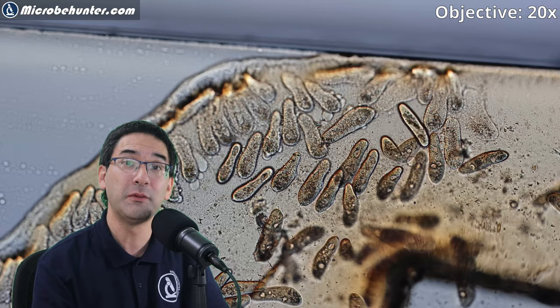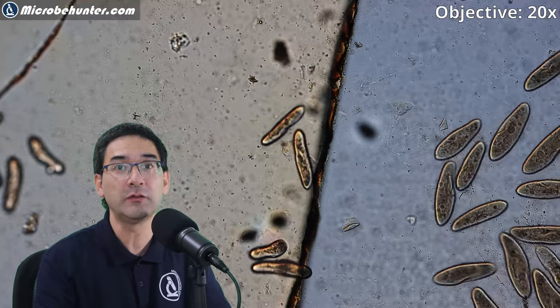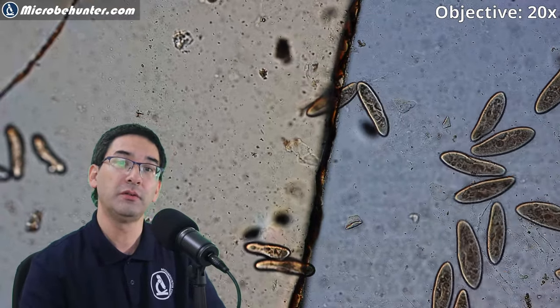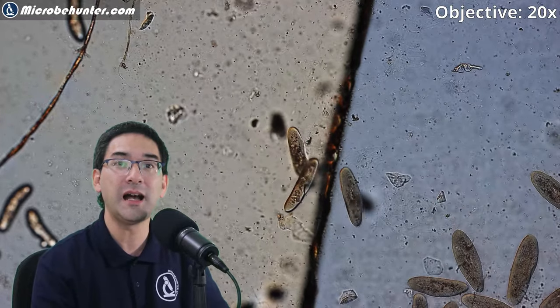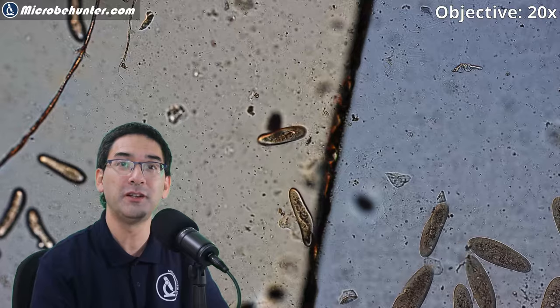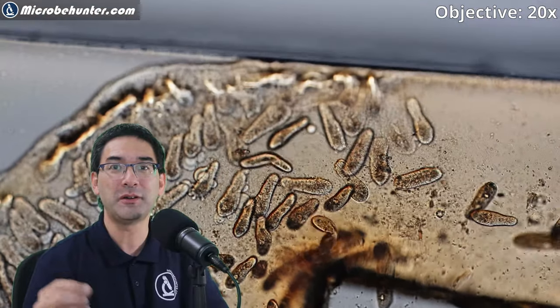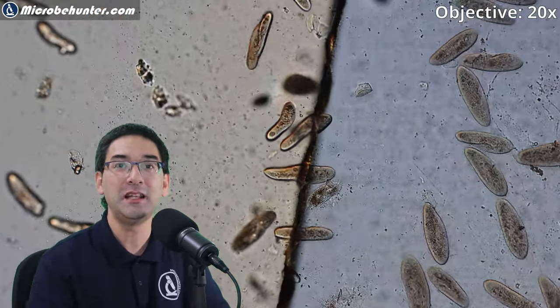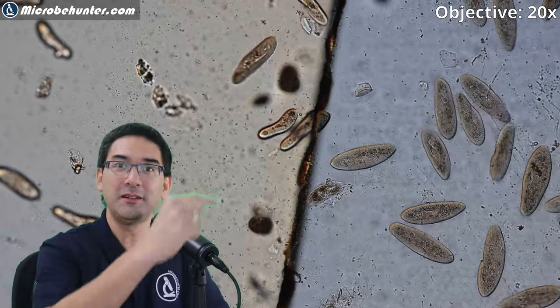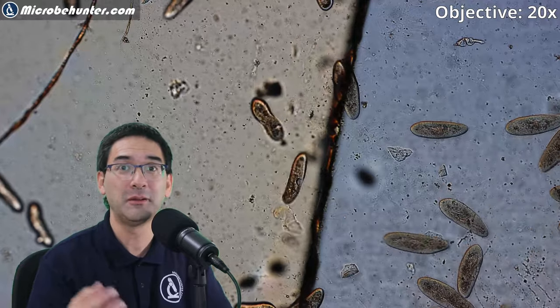You can see that some of them have already stopped moving. This line here is the edge of the cover glass — on the left side is the area with a high concentration of chili, and on the right side, beneath the cover glass, is the safe area. As soon as some of those paramecia swim out into the chili area they immediately start to spin very rapidly and move off.